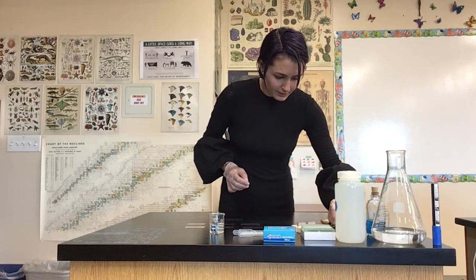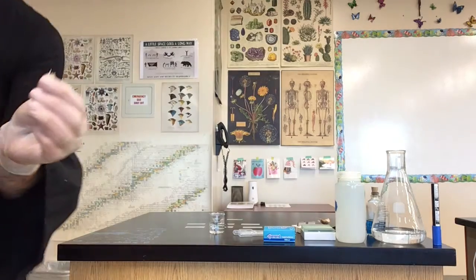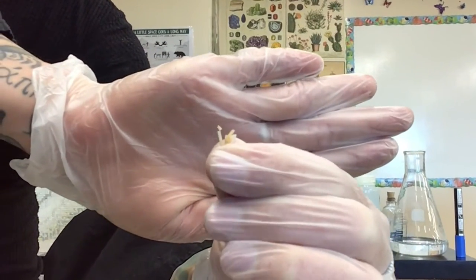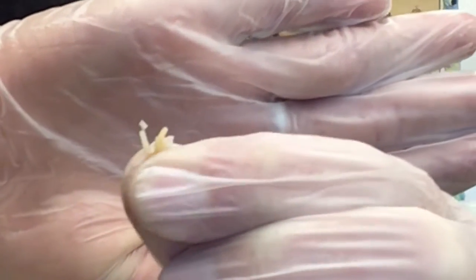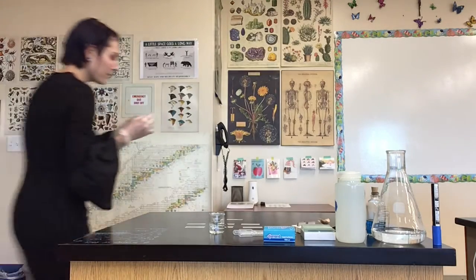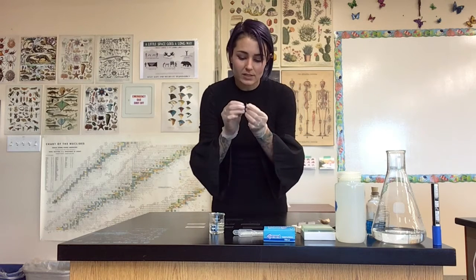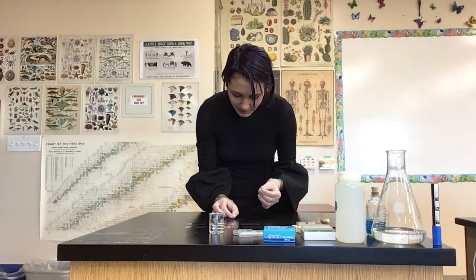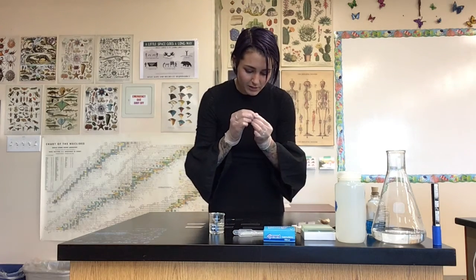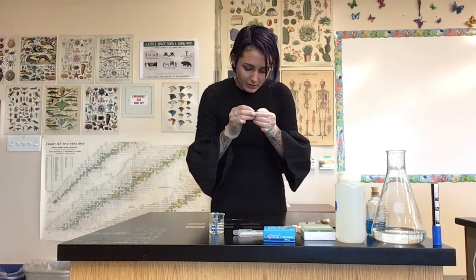So, first thing we're going to do is I'm going to take my little roots here. Let me show you nice and close up. So these are the roots that you would find at the base of a thing of garlic, or if you have onion roots, the green onion, all of them will form these little roots. And as we now know, mitosis is the way that our cells grow and replicate, which means that there's a very high chance that we can catch some cells doing mitosis actually in these roots themselves. Just because this is where a lot of growing and replicating is going on.